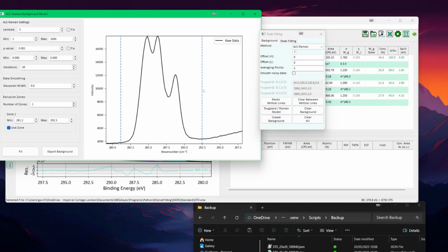And that's usually how Raman baseline is created. So I'm not sure if it will work here, but you also have a smoothing window where you would try maybe 4, which obviously doesn't work well here, but if I try with a noisy Raman, usually Ramans are quite noisy, then you would get good data, especially for the noise, because it doesn't take this data. This is the excluded zone where it will not fit the background. And so if I now try this, it may do something good, something bad.